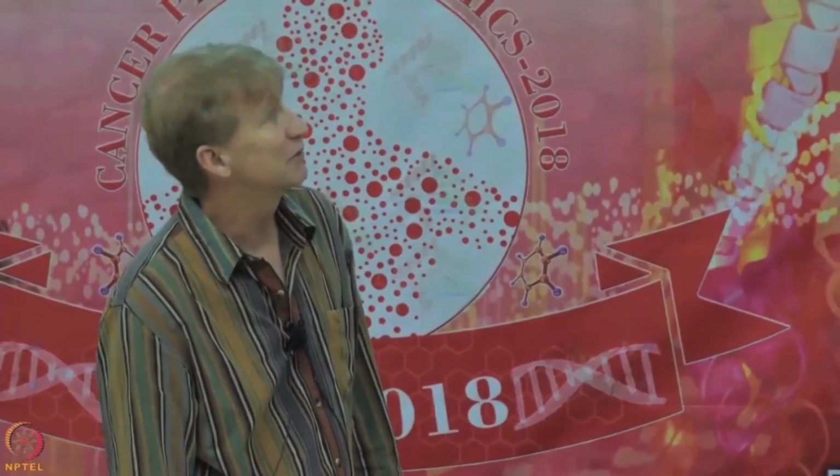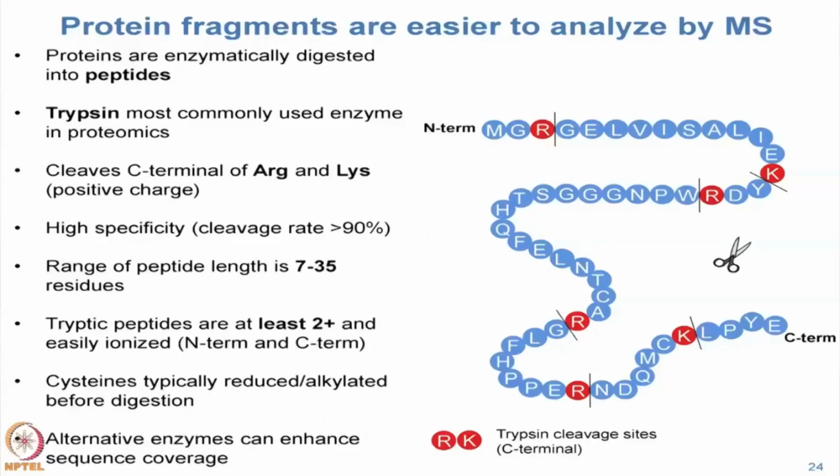Most proteomics today is done in a way where there's going to be a digestion step to peptides, okay? Trypsin is by far the most common enzyme to use, and it gives you convenient lengths of peptides that generally tend to work well in a mass spectrometer. They have the property that they have a basic amino acid at the C-terminus, which is going to give you somewhat better fragmentation than if it's not at the C-terminus, okay?